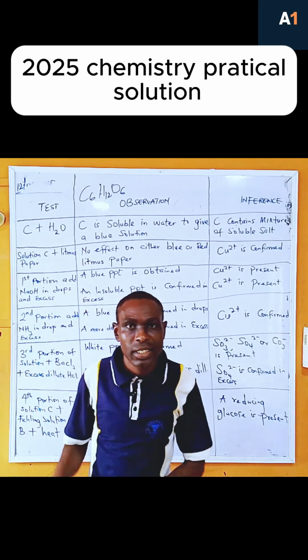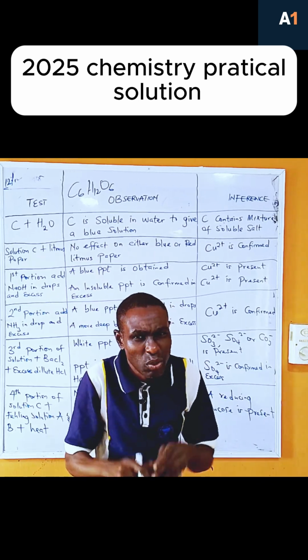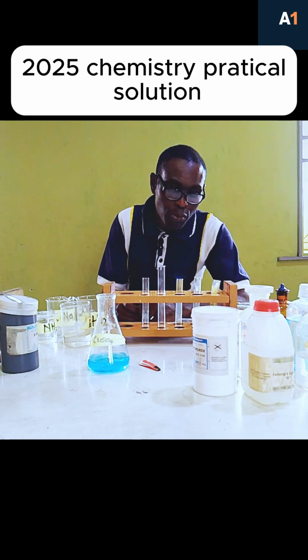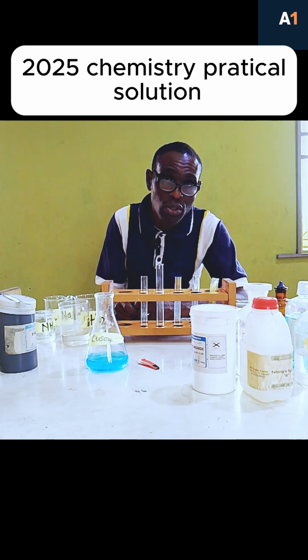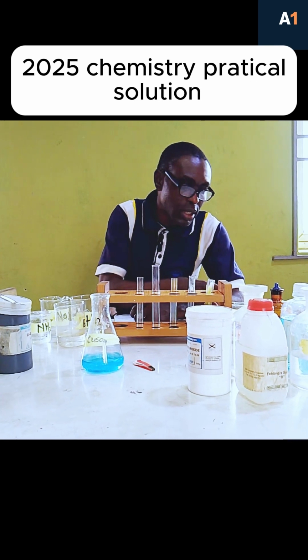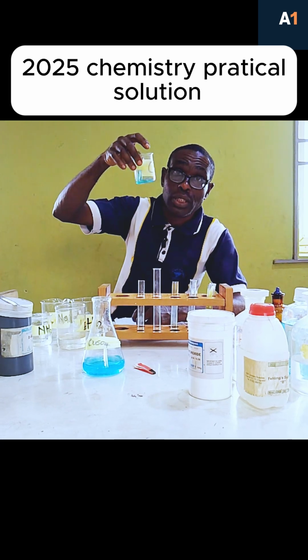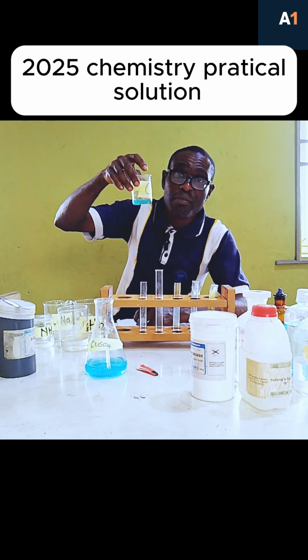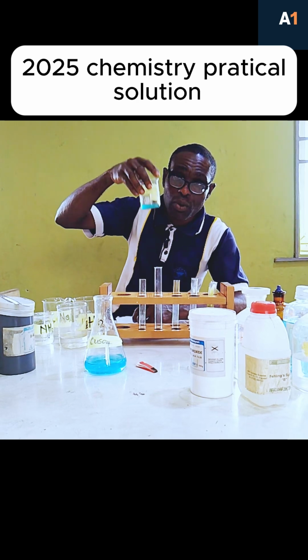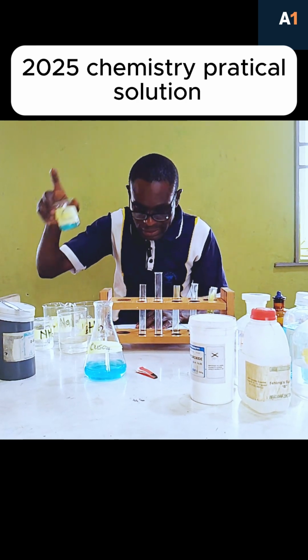So here is what I can explain. Whatever you see, just record it. So let's start the practical. Now, we are asked to provide C, which is a mixture of organic and inorganic substance. This is C. This is a 10 centimeter cube of C, which I've prepared. I've mixed it together and added water. Now, let's go to what we are asked to do with that C.